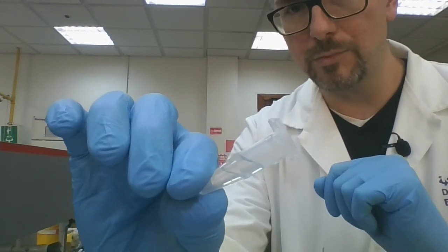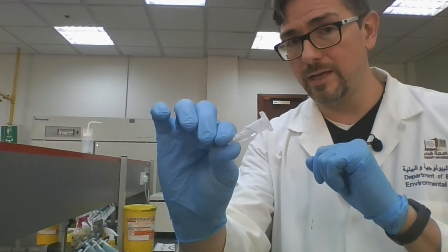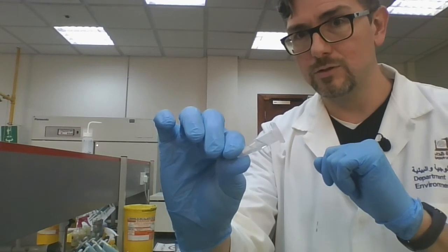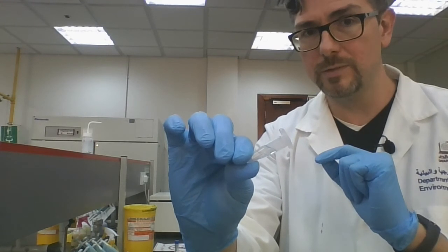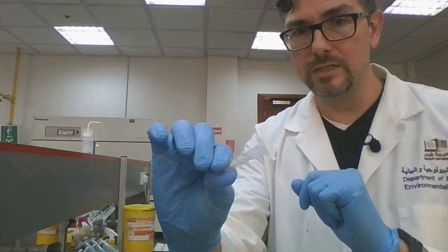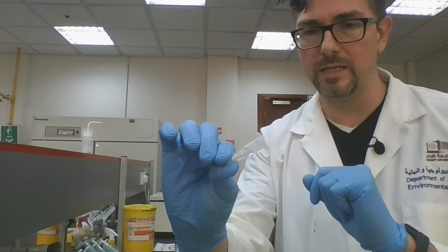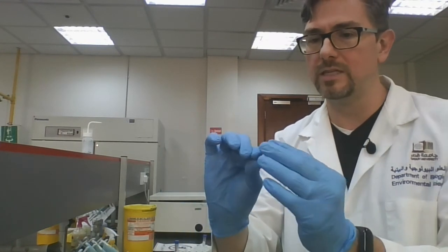Now, again, I put in 400 microliters, so in theory, I should be able to take 400 out, but I don't want to get greedy. I don't want to take up any of the organic phase. And so in order to make sure that doesn't happen, I am going to actually take less. So I'm going to take 350 microliters of the solution from here instead of the 400 that I actually put in here. And again, don't get greedy. There's more than enough DNA in there. You will still have a sizable DNA pellet at the end. So don't worry about losing stuff.